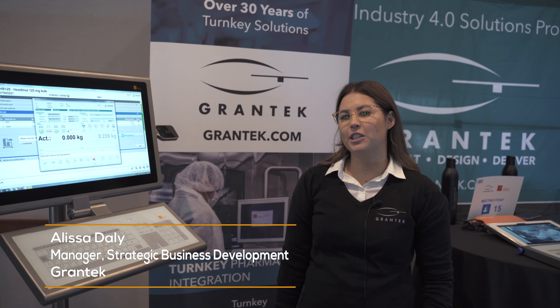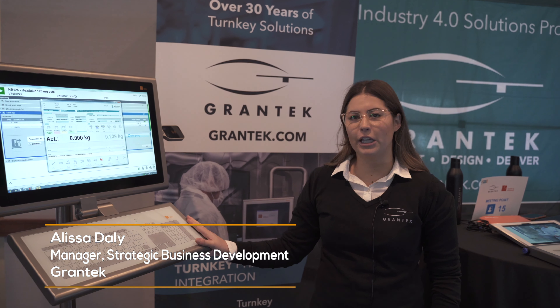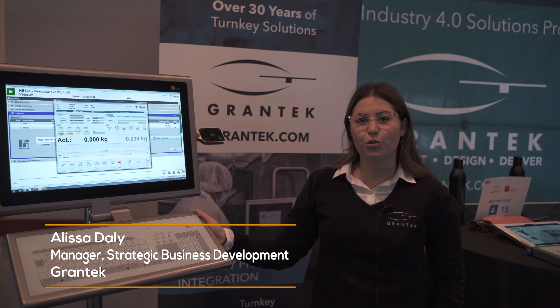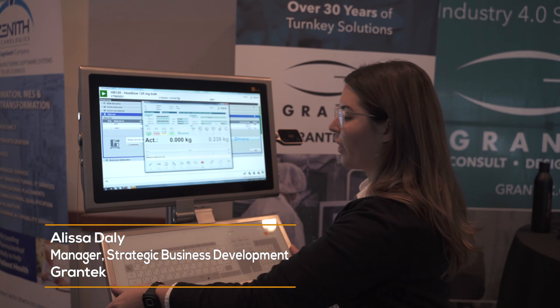A typical Grand Tech customer looking for a SysTech and Solutions cleanroom solution is looking for something that is highly cleanable, reliable, and ideally mobile — like this SysTech and Solutions trolley here — and something that's ergonomic, which is what the torque hinged keyboard really does provide.